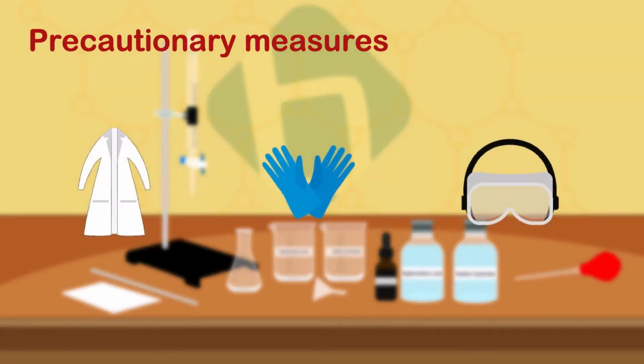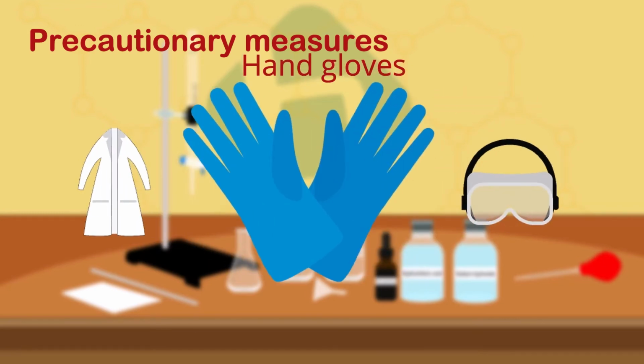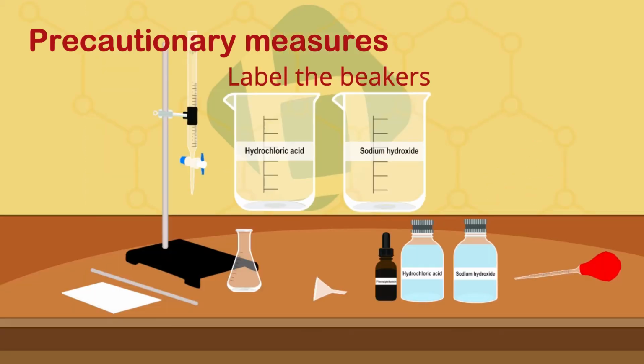Precautionary measures to be taken are: use protective equipment such as a lab coat, eye goggles, and hand gloves. Make sure the stopcock at the bottom of the burette is not stiff, blocked, or leaking, as this will make the experiment unsuccessful. Label the beakers before pouring in the various chemicals to avoid mistakes or contamination.